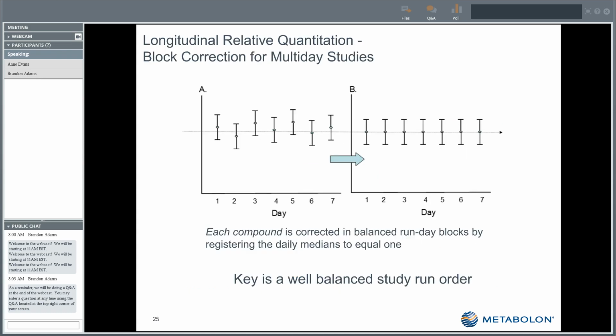Now finally, the last thing I really want to talk to you about today, and it's certainly always on the minds of people doing these much larger metabolomic studies, is how we start correcting for variation in the data which is not coming from biological variation. We know, running mass spectrometers over days or months, that there are inherent differences in sensitivity on any given day, and that, if left uncontrolled, can mask quite a bit of biological signal.